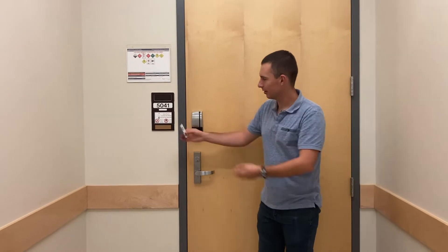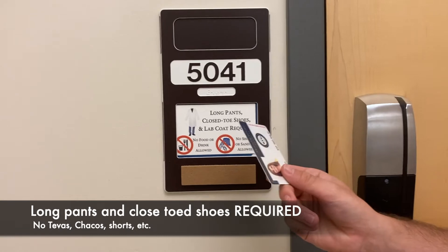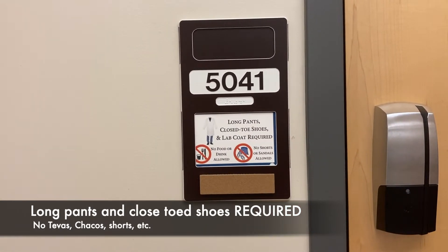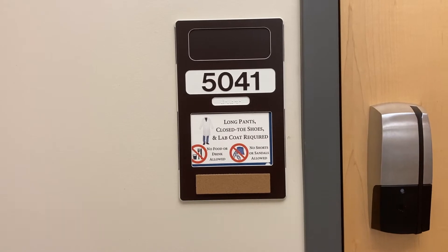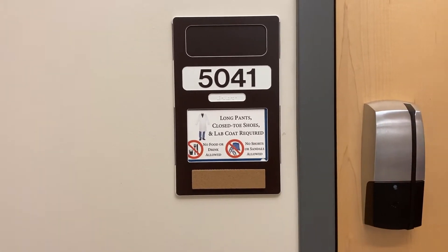However, before we get you started, we want to make sure you get a nice tour of the lab and a general overview of safety. Safety is a top priority for us. Before you even walk in, you'll notice there's a board that reminds you of the dress code. We want to wear long pants and closed-toed shoes — no shorts, no sandals, no tevas. Safety is more important than fashion.